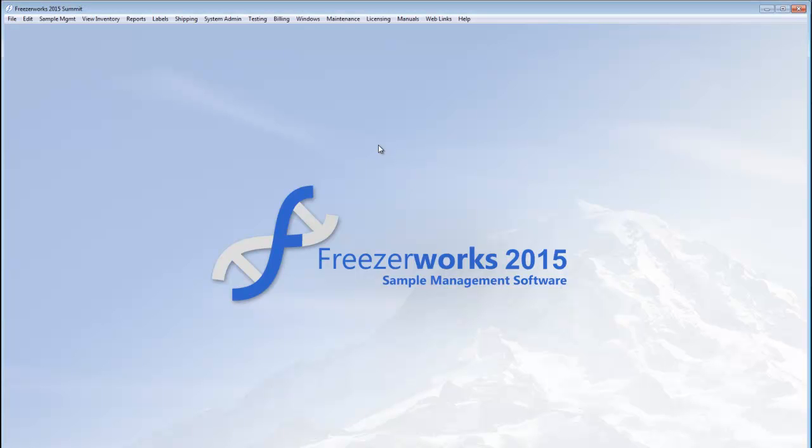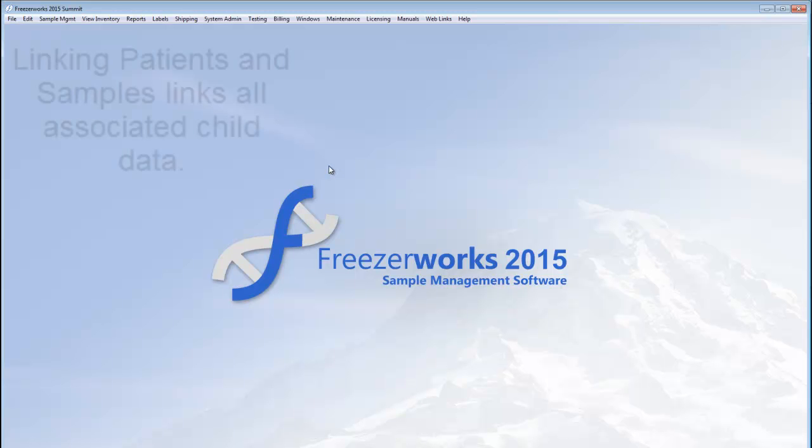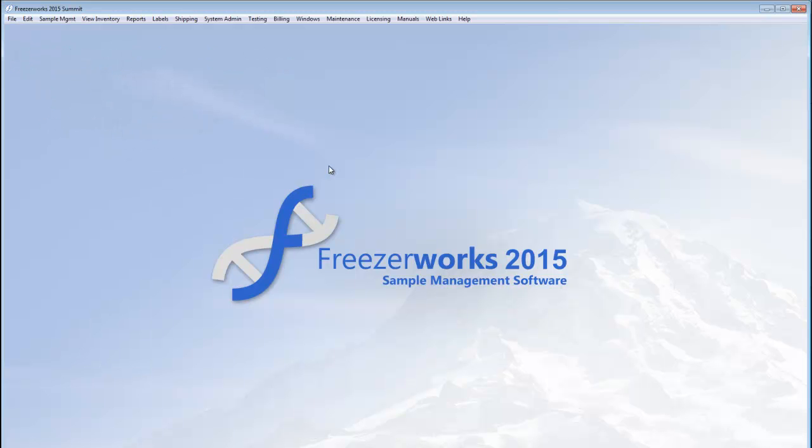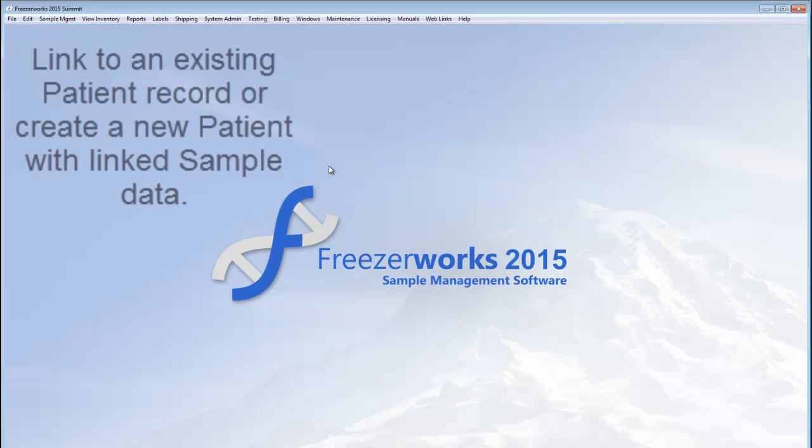At the heart of FreezerWorks 2015 summit is the new patient management module. In order to use patients effectively, you must link them to associated sample records, and by proxy, those samples aliquots and tests. You can link existing patients or create and link a new patient in one fell swoop.